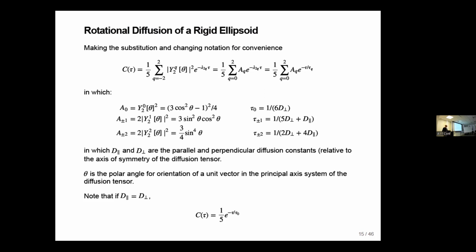So now you can see there's a problem. If we have an American football and the NH vector points along the long axis and doesn't see rotation around that long axis, the CSA tensor is going to be pointing away from that axis. So it is somewhat sensitive to that rotation.